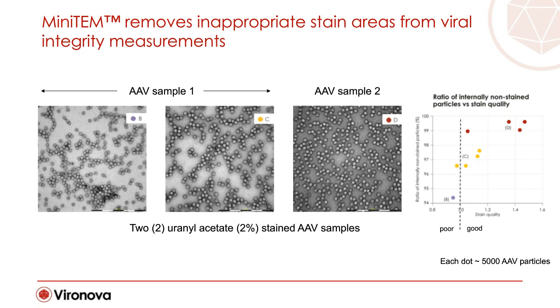So the salt is giving us a contrast shift on the particles, but this salt is also embedding the particles so that they are stabilized when the water is dried off.